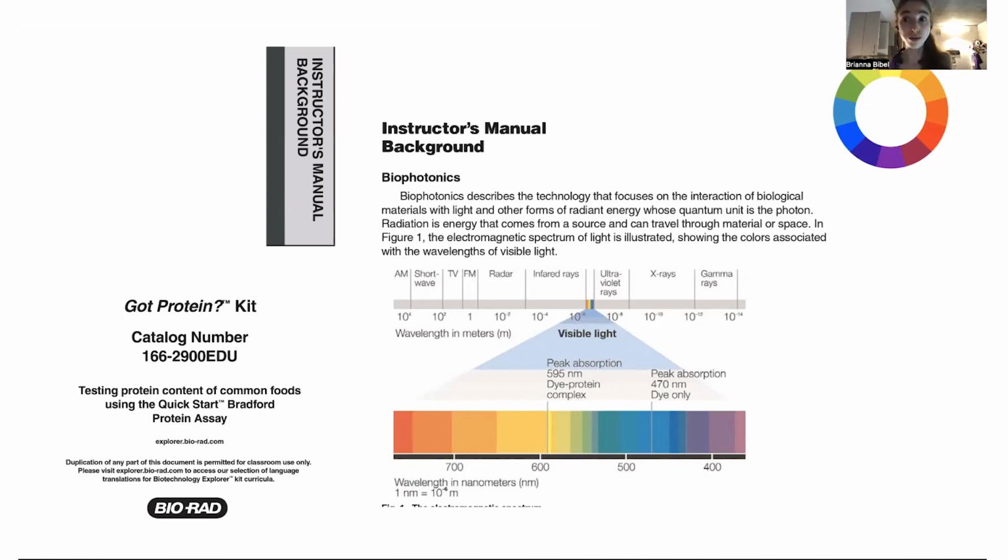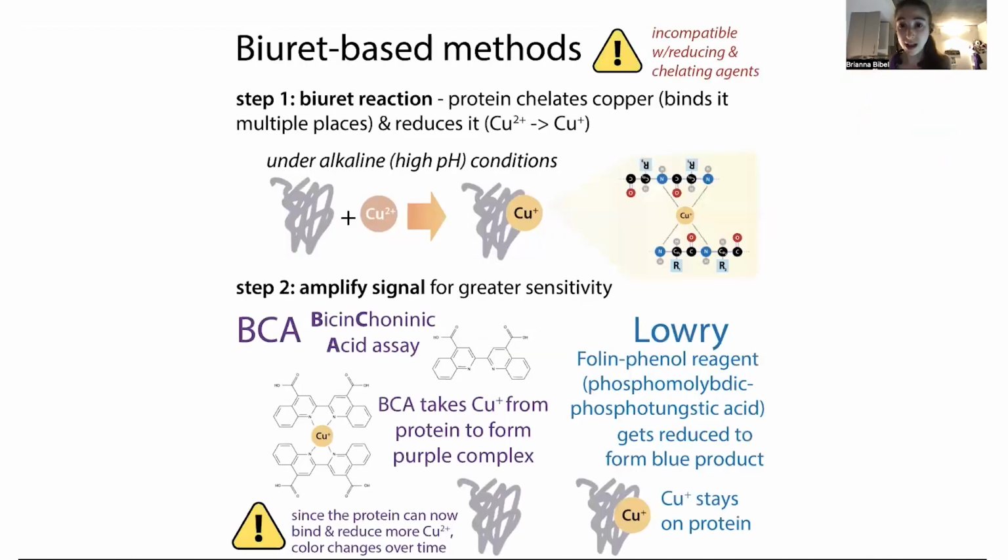Because you don't see it, it's getting stolen by the molecules, and different molecules will have different wavelengths that they absorb, and therefore different wavelengths that we see. And we can take advantage of this to measure different wavelengths of absorption and get information about different types of things.